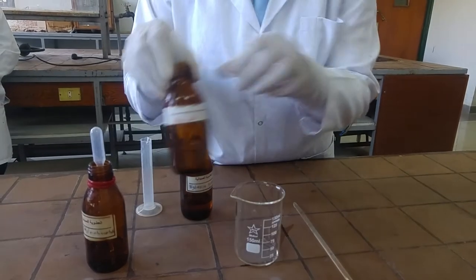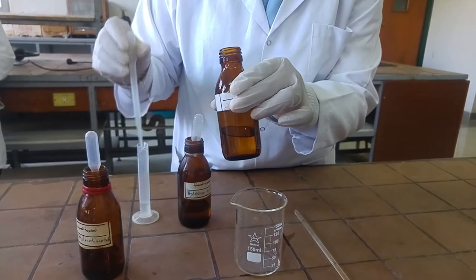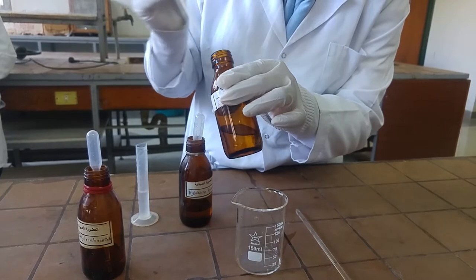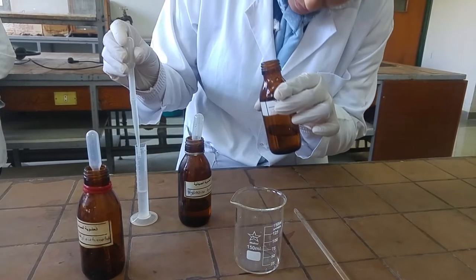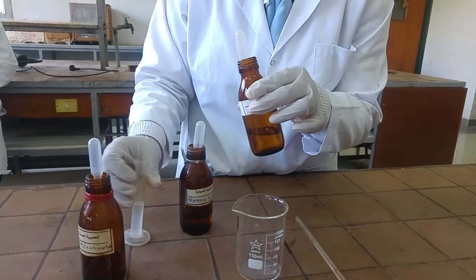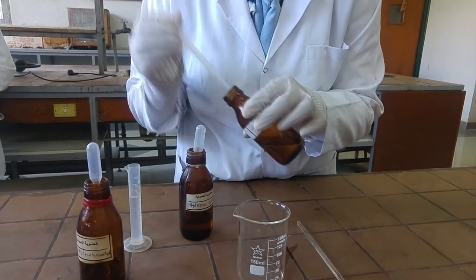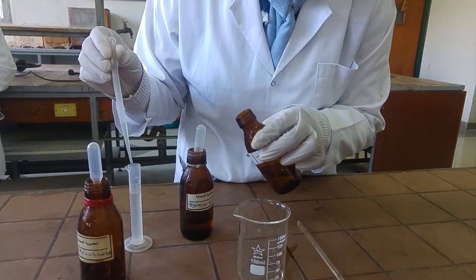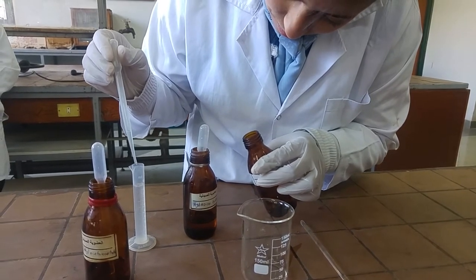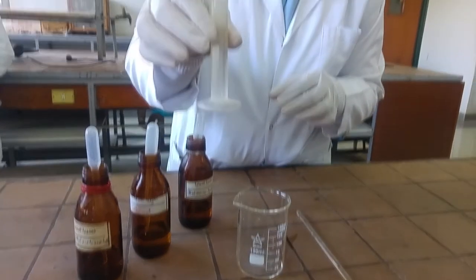Then, add 10 ml of ethanol to a measure. Add the content of the measure to the beaker.